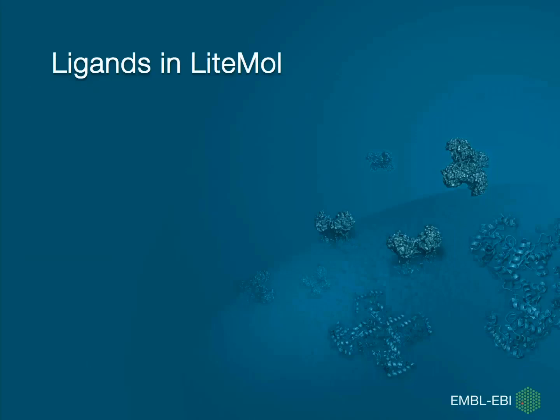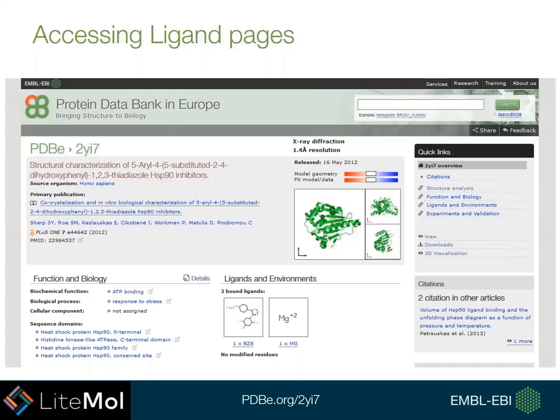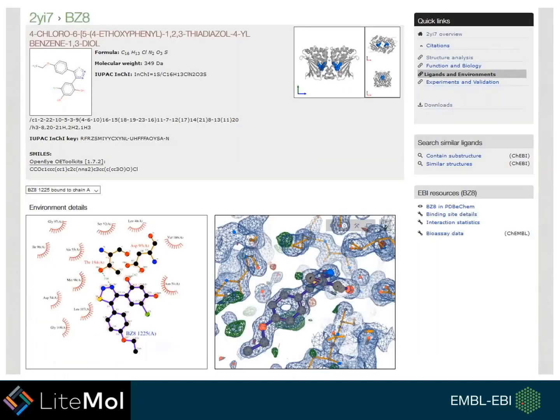Lightmole has been incorporated into the PDBE ligand pages for entries in the PDB. If you want to access ligand pages, navigate to an entry at pdbe.org. In the Ligands and Environments section, all these ligands are listed. You can then click through to one of these, which will take you to the page for that specific ligand in that specific entry, where you get a number of pieces of information about the ligand.